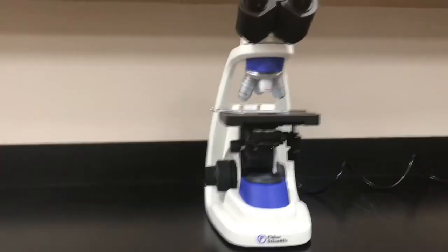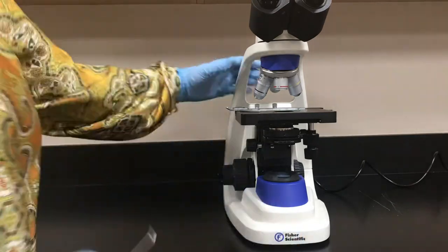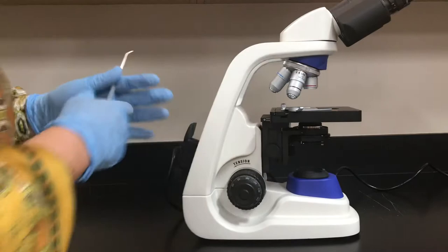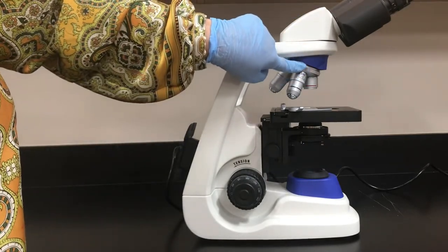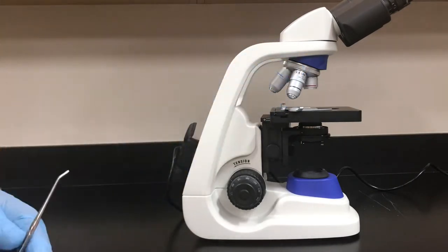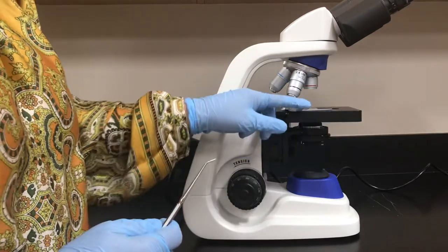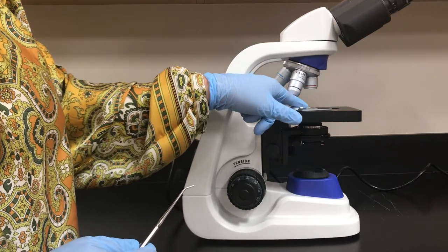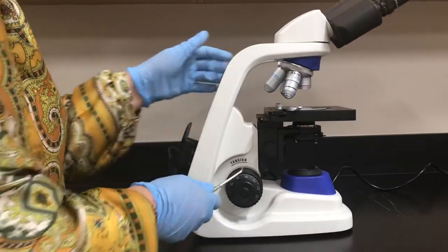For example, the part we call the base, the part we hold we call the arm, and this is the body. Here, all the objectives assemble on the nose piece or revolving piece. We have the stage, and we have stage clips. That's how we're able to put the slide in it.